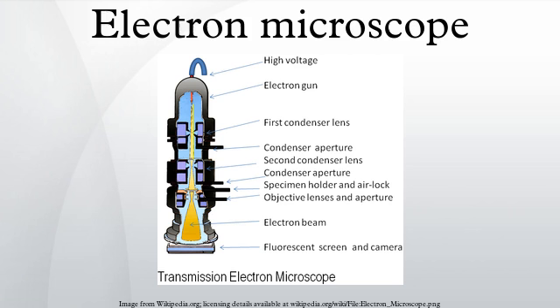Reflection electron microscope. In the reflection electron microscope, as in the TEM, an electron beam is incident on a surface, but instead of using the transmission or secondary electrons, the reflected beam of elastically scattered electrons is detected. This technique is typically coupled with reflection high-energy electron diffraction and reflection high-energy loss spectroscopy. Another variation is spin-polarized low-energy electron microscopy, which is used for looking at the microstructure of magnetic domains.